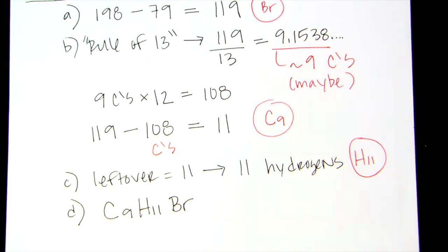Okay, so you've seen DOU numbers, they're usually somewhere between 0 and 5. So if you get something reasonable where you can draw a normal looking reasonable structure, then that's a good estimate for your molecular formula. So for this one, if I calculate my DOU, you get 4.